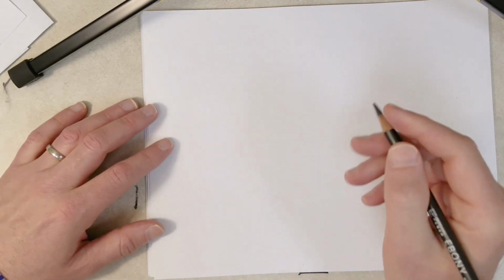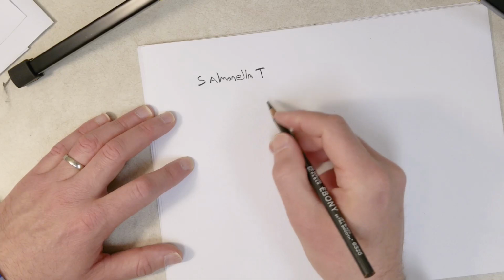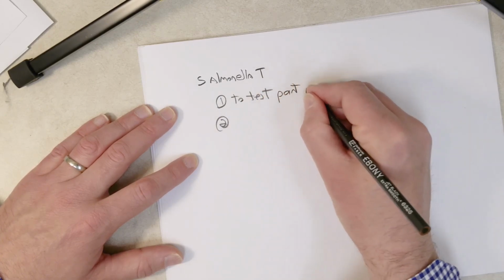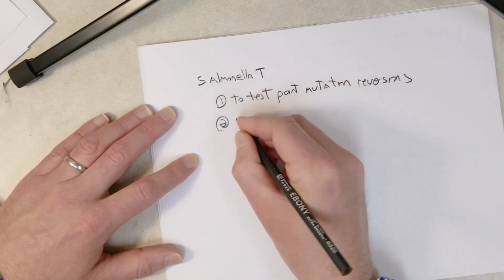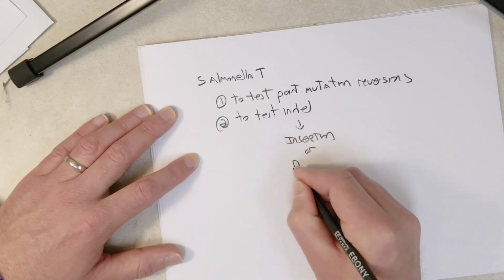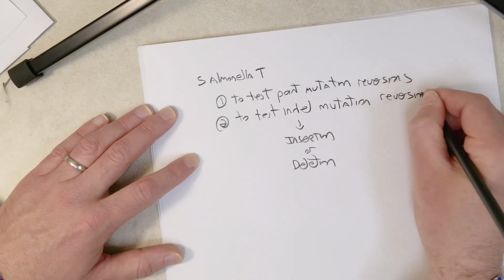Long story short, we can use different strains of Salmonella, say 1 strain to test for point mutation reversions, and another to test for indel, which is insertion or deletion, mutation reversions.